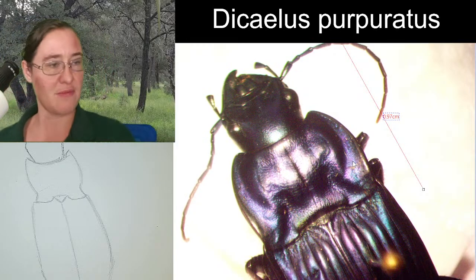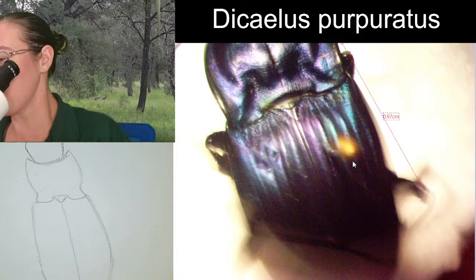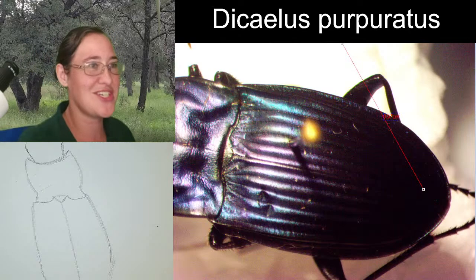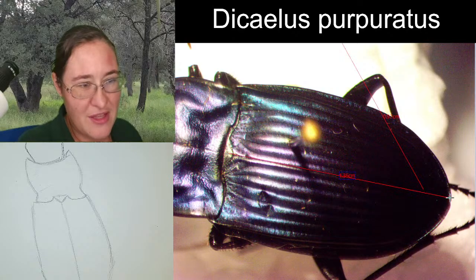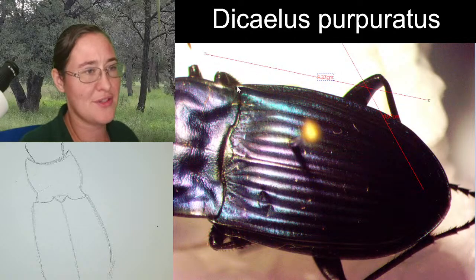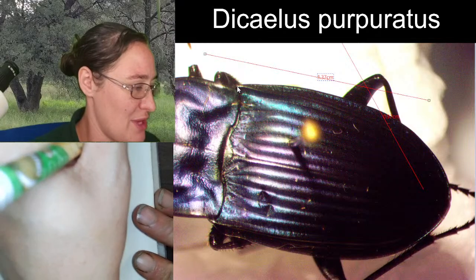And then I'm going to scooch the specimen, scooch, scooch, scooch. Hopefully the elytra fit. I think I might have to turn it sideways, but yep, it fits. If it fits, it ships. Okay. So, the elytra are 1.37 centimeters. Let me do a little bit of math here.